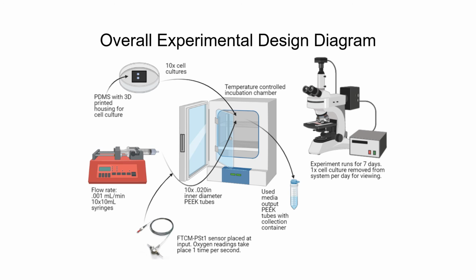Our team expects this method, as well as a chamber design, could be utilized for testing the effects of medicine or other cellular conditions on isolated parts of a neuron, furthering research on diseases causing neuron degeneration or death.